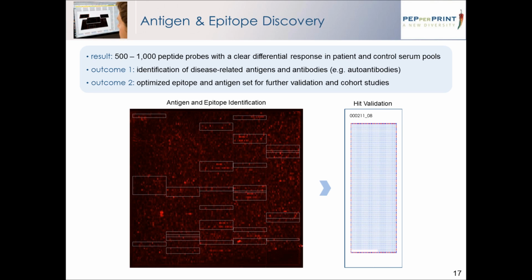And these kinds of studies are interesting, for example, if you would like to define immunogenic regions of pathogens for vaccine development, or if you would like to discover biomarkers from a large peptide dataset.